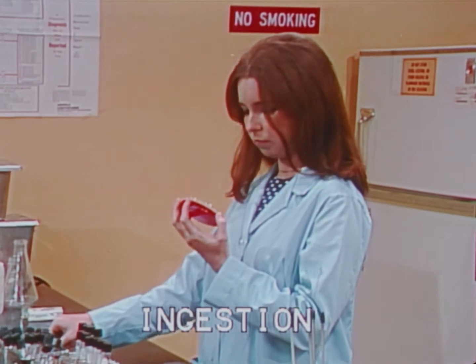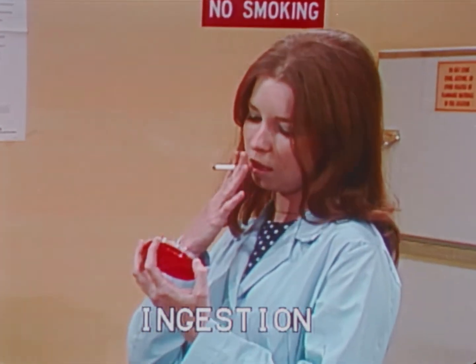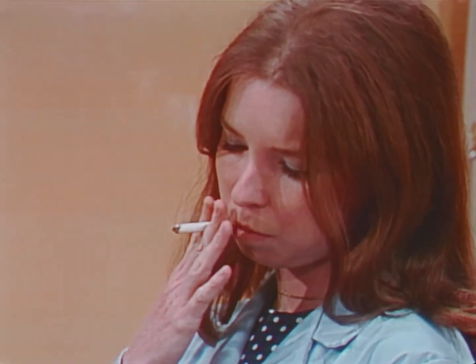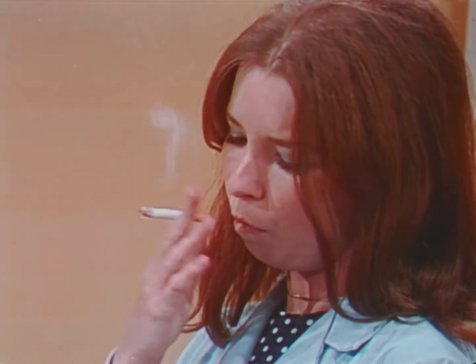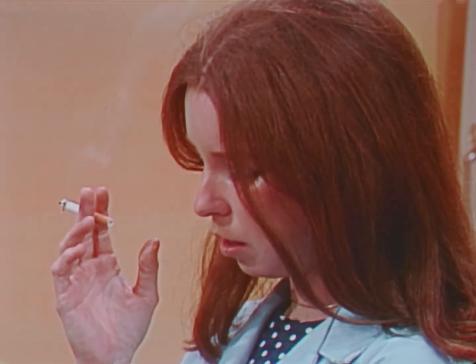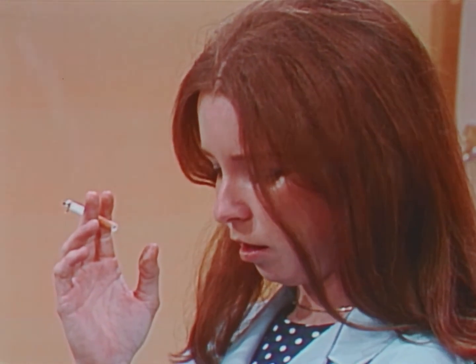Ingestion is another frequent route of infection. Salmonellosis, shigellosis, or other enteric diseases are commonly spread in this way. Touching contaminated surfaces can result in finger-to-mouth transmission of these infectious agents.